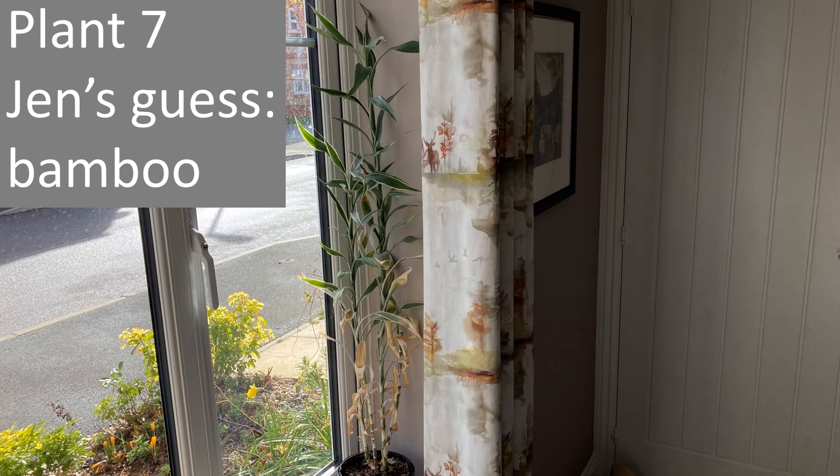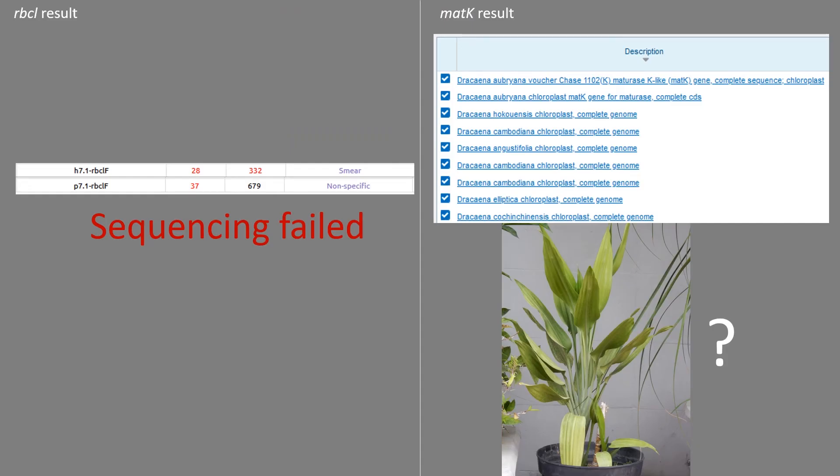Finally, I picked some leaf from a plant which I think is some sort of bamboo. Unfortunately both sequences failed for the RBCL primers. The MATK results consistently came back with the genus Dracaena, which it could be — if you google those they look sort of like it, but not exactly. And if I'm honest, based on the MATK results for the other plants that I was confident about, I probably wouldn't trust this one either.